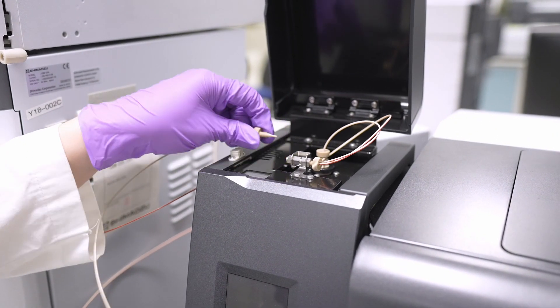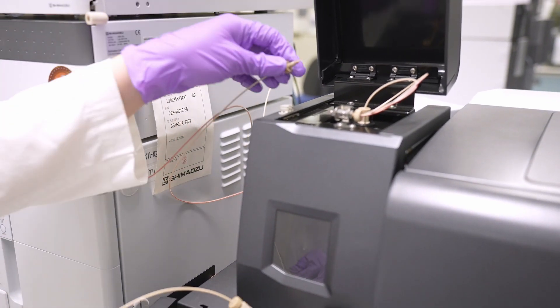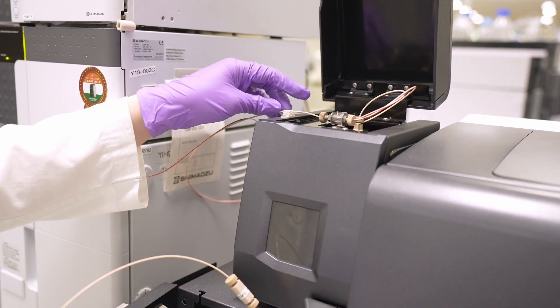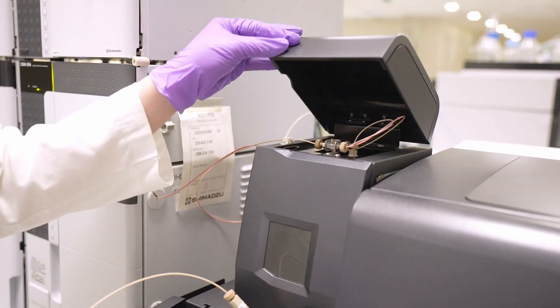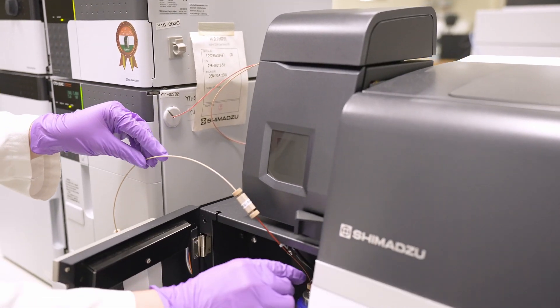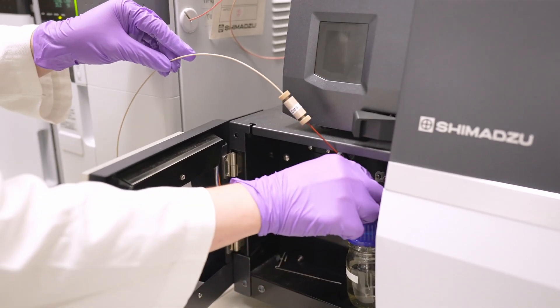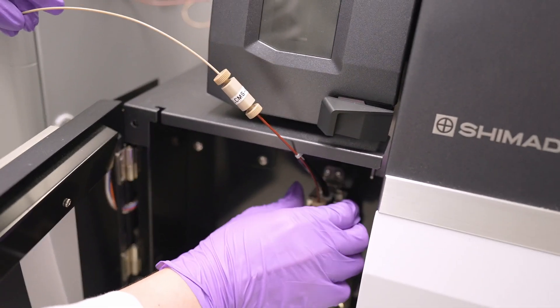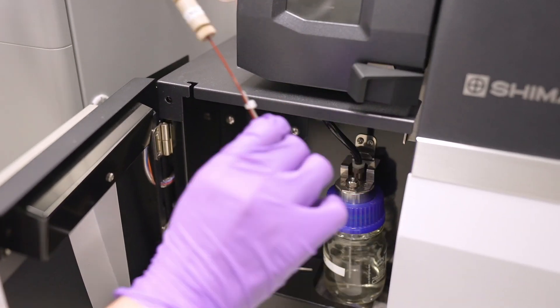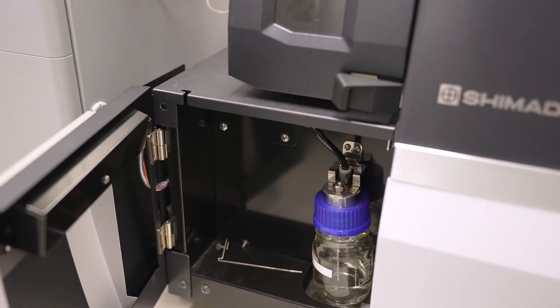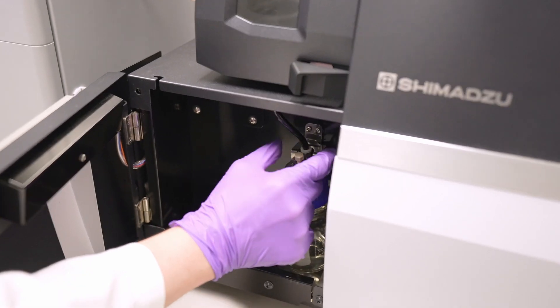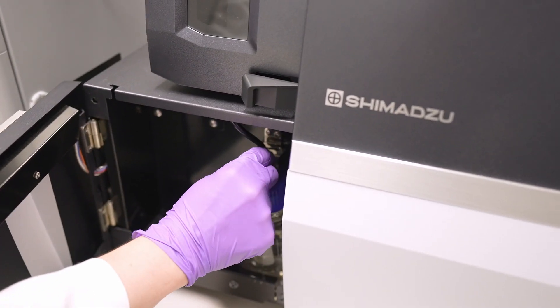When the auto-tuning is done, remove the resistance tubing from ESI probe and replace it with LC tubing. Lastly, remove resistance tubing from sample bottle and install back the plug. LC-MS triple quadrupole is ready for use again.